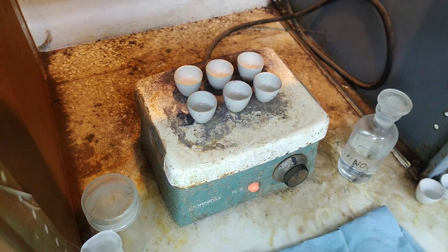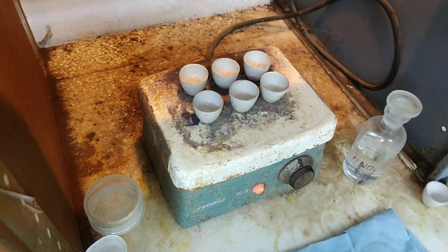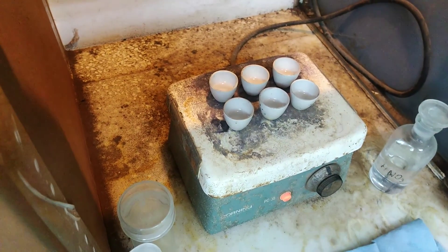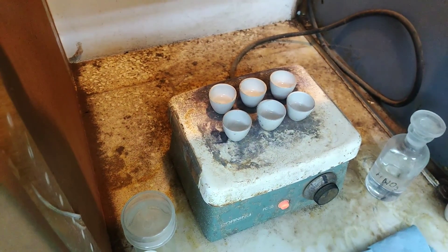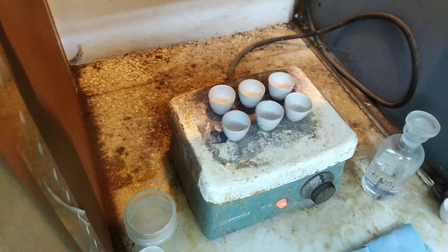There was a misspeak in the previous clip — it was 3.8 milligrams, not 3.8 grams. These samples ran anywhere from about 4.1 up into the 6-milligram range. So not great, not terrible.